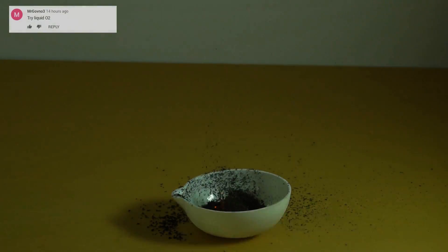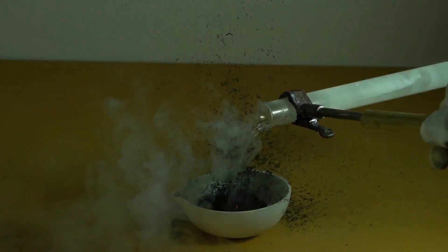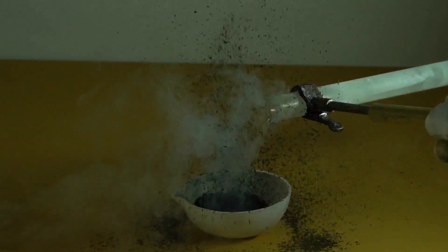I believe somebody in the comments asked to add liquid oxygen to decomposing ammonium dichromate. I really have no idea about what chemical reaction you're expected to see.